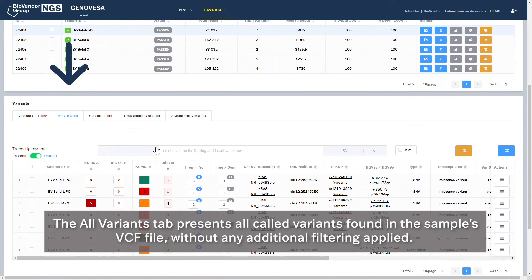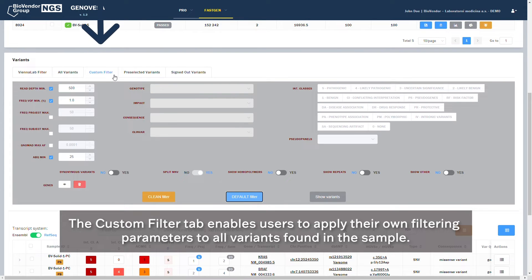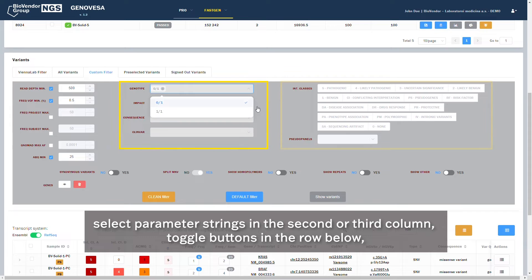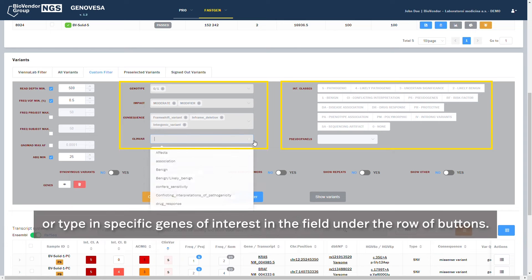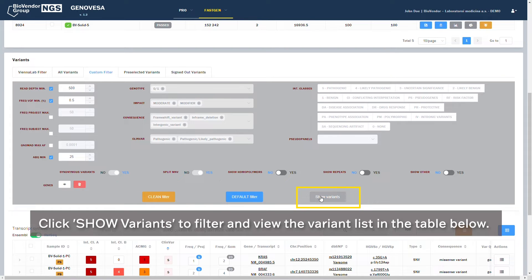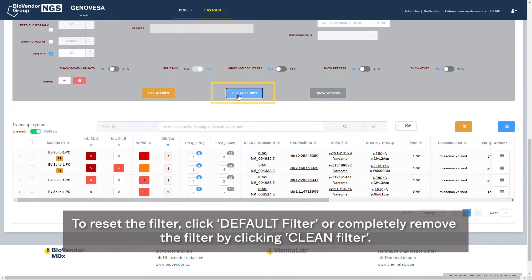The All Variants tab presents all called variants found in the sample's VCF file without any additional filtering applied. The Custom Filter tab enables users to apply their own filtering parameters to all variants found in the sample. Default filtering parameters are determined by the current workflow. To filter by different parameters, you can use checkboxes in the first column, select parameter strings in the second or third column, toggle buttons in the row below, or type in specific genes of interest in the field under the row of buttons. Click Show Variants to filter and view the variant list in the table below. To reset the filter, click Default Filter, or completely remove the filter by clicking Clean Filter.